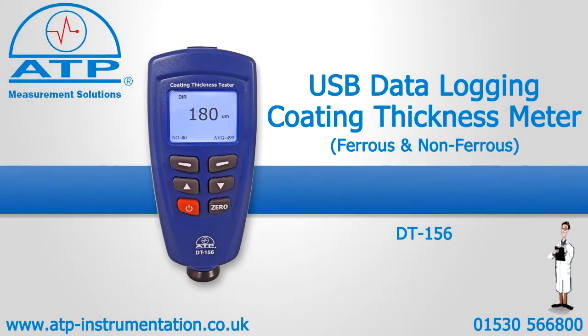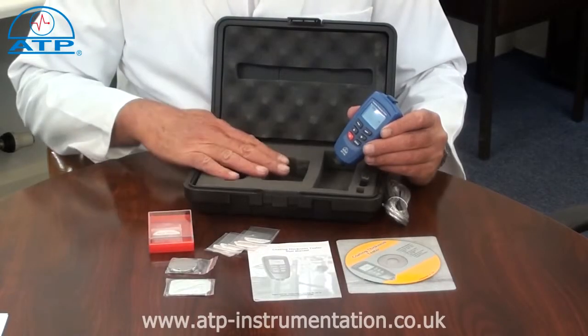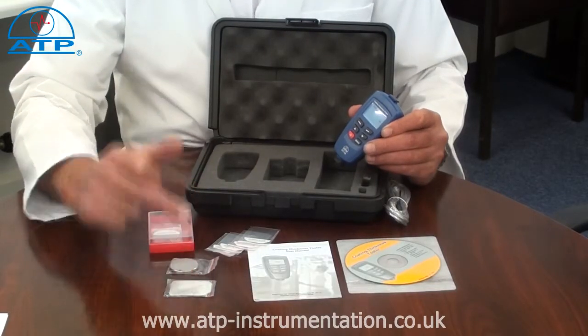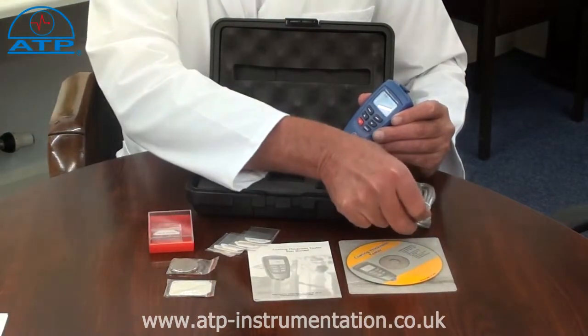An introduction to the USB data logging coating thickness meter. It is supplied with a hard briefcase-style carry case, one ferrous and one non-ferrous base plate, calibration foils, software, and a USB connection cable.